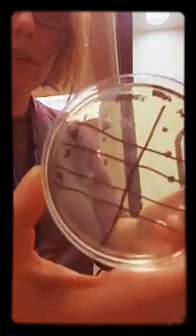So again, I'm in my before column, and I'm just going to pretend like I'm being fingerprinted. In the second lane, third lane, you roll it. Fourth lane, roll it. Whew. I don't know if you can see this, but you can see where I've touched it because I've got so much grittiness on my fingertips right now.